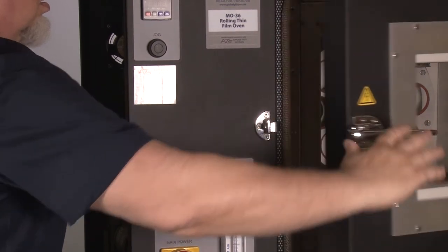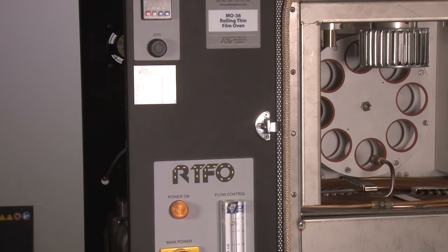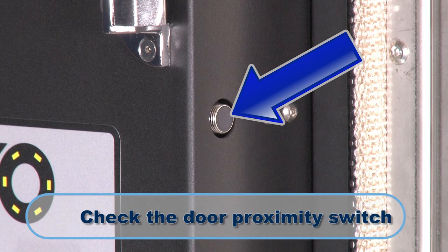Open the unit's door and press the jog button to verify that the carousel is rotating. If the carousel still does not rotate, check the RTFO's door proximity switch.